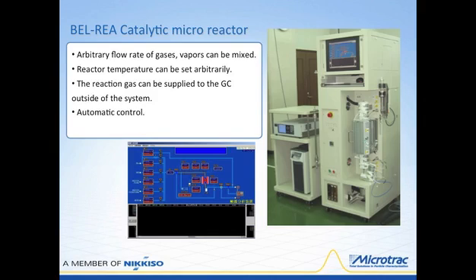The GC will give the amount of different gases, even gas mixtures that are being proposed and addressed to the sample, the material, if it's a catalytic converter or other type of substrate. And from that, the instrument can monitor the surface area and the effects of what gases are reacting and how well they're reacting in terms of the stoichiometry of the chemistry.